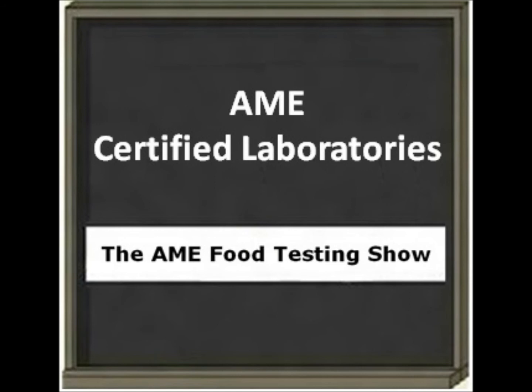I've been consulting for a couple of companies to help them develop these assays and then move them into the clinical space in two different areas, largely infectious disease, and the second area of application is cancer diagnostics, more specifically and more recently, a group of tests called companion diagnostics, where you use the test to predict the efficacy of a drug. So that's largely what I'm focusing on as far as my clinical practice goes.